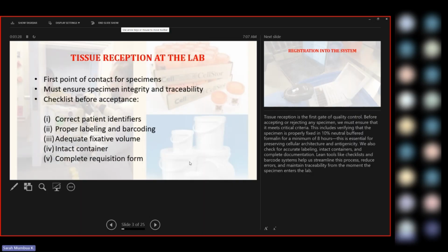While we are still checking on the sample registration and reception, check the request form. Is it well documented and well filled, with the credentials of the patient, that is the name, age and sex, and at least some clinical information, such as whether they have done any investigations?